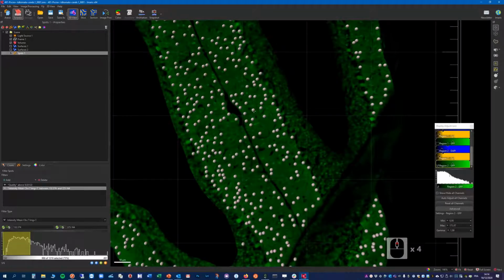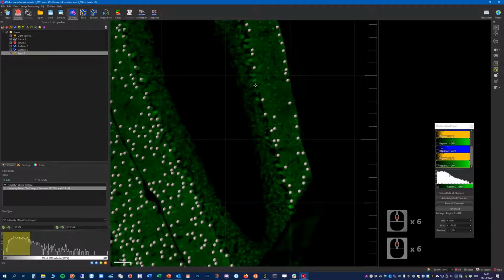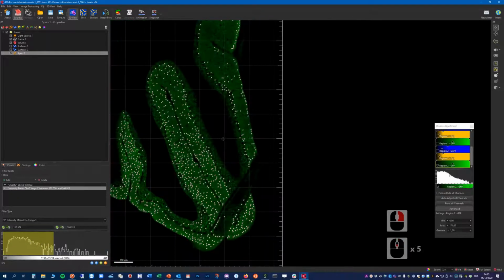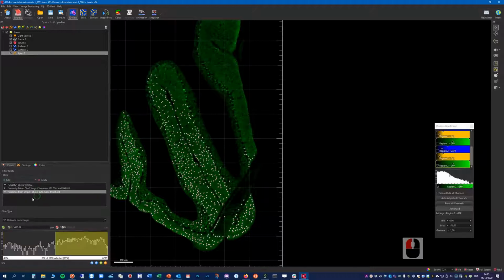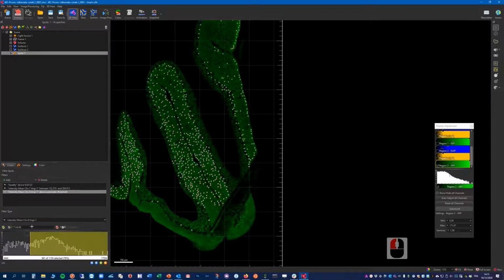Obviously some of the spots we detected were missed here, but statistically speaking, it shouldn't be an issue. The problem I see here is that those big green cells are now missing. So we really want to make sure we include those back, something like this. Yeah, and now we still have those there. So let's see if we combine this with a new filter, this time based on the other channel, if it will work better. So in this case, in channel 8, and interesting.